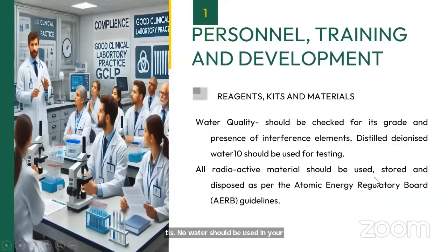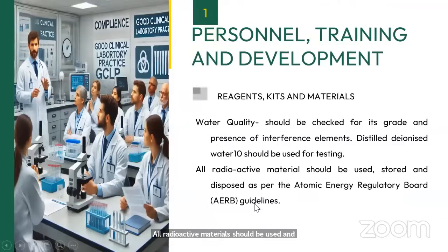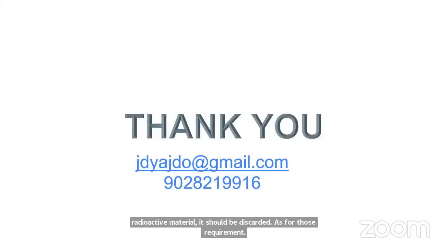All radioactive materials should be used, stored and disposed of as per the Atomic Energy Regulatory Board, that is AERB, guidelines. So whenever you are using any radioactive material, it should be discarded as per those requirements. So with this, we are concluding today's session.